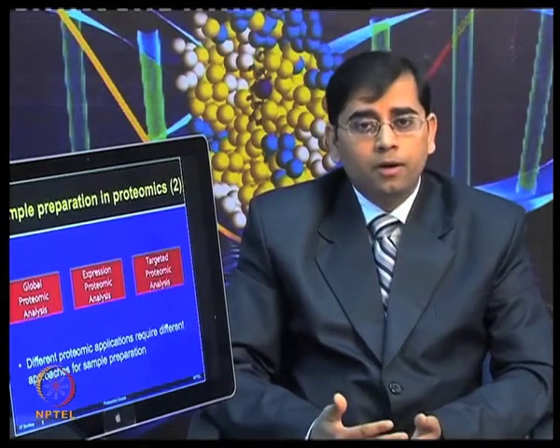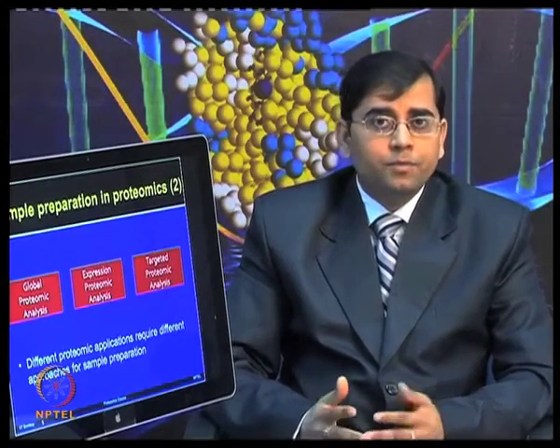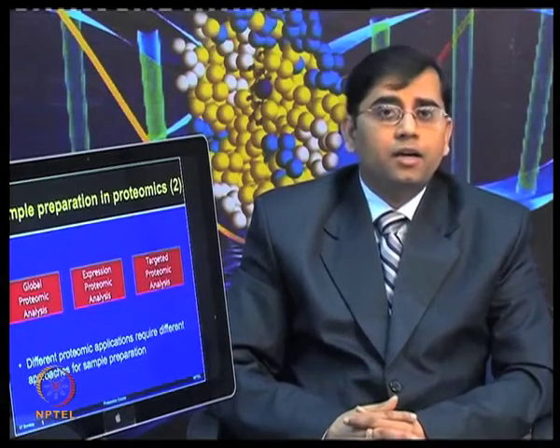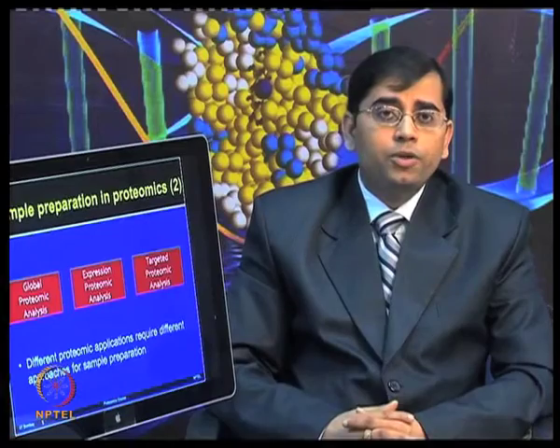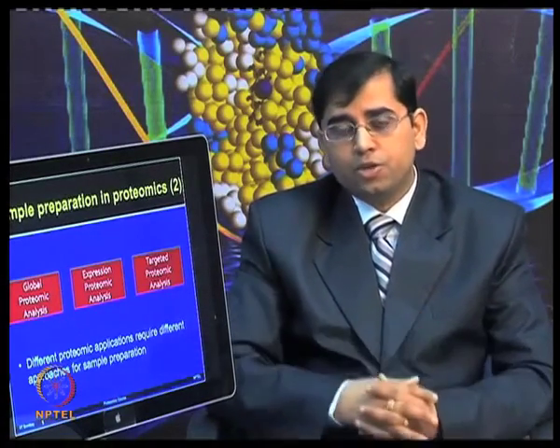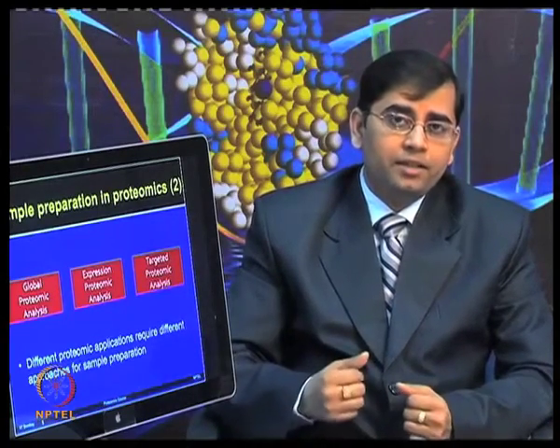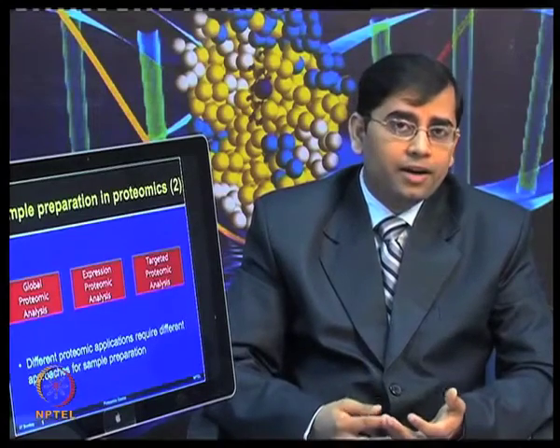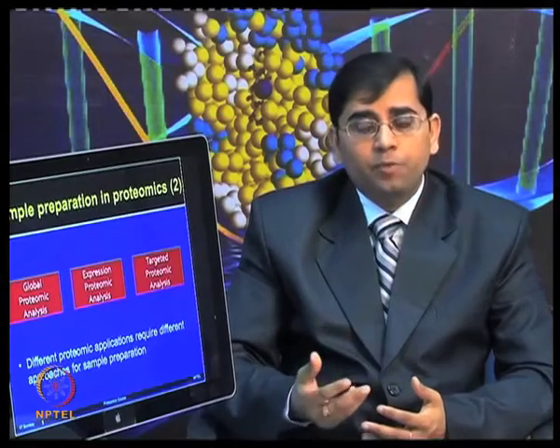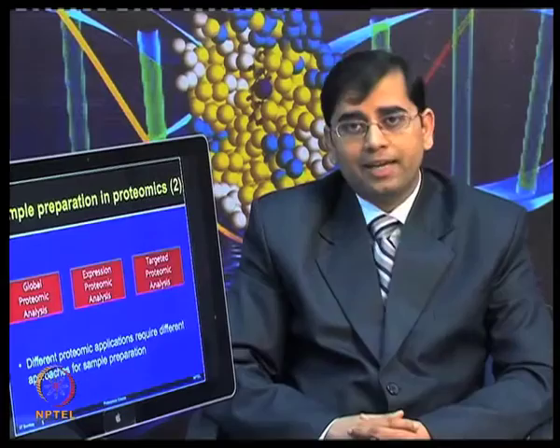Whether you want to do global profiling or expression profiling, in either case you need to extract all the proteins present in that particular target sample. Now, when you are looking at targeted proteome analysis, you want to pre-fractionate your sample in such a way that only that particular component is isolated, and then all the proteins from that organelle or cell are extracted. So, different types of strategies need to be used to perform these types of proteomic analysis.